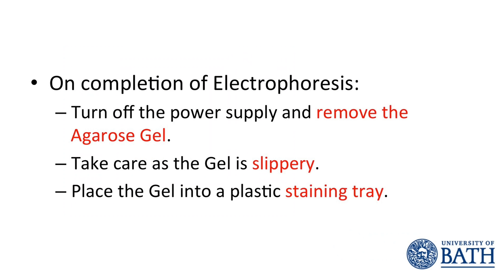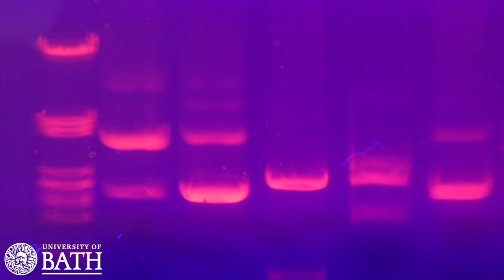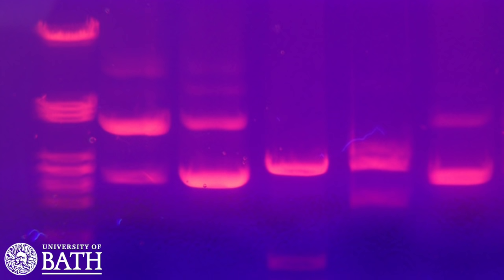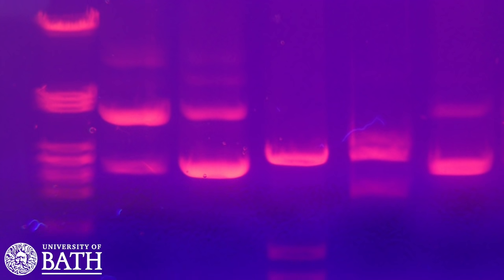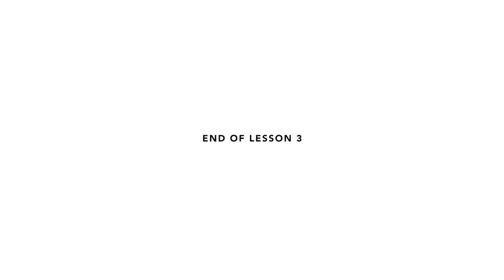When the electrophoresis is complete, turn off the power supply and remove the lid from the gel box. Carefully remove the gel tray from the gel box — take care as the gel will be slippery. Using your thumb, nudge the gel from the gel tray allowing it to slide into your plastic staining tray. Your gel is now ready to be stained. Staining the gel will reveal the strands of DNA on the gel and allow you to interpret your results. This is the end of Lesson 3.